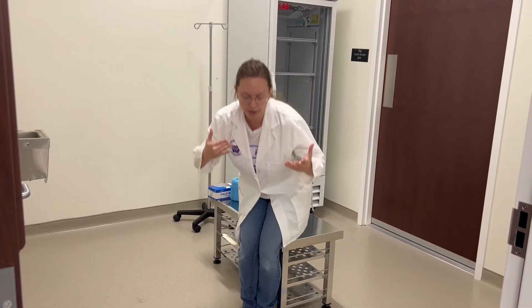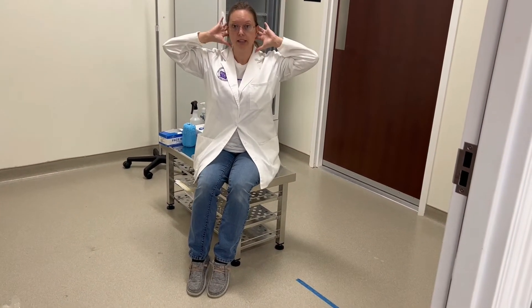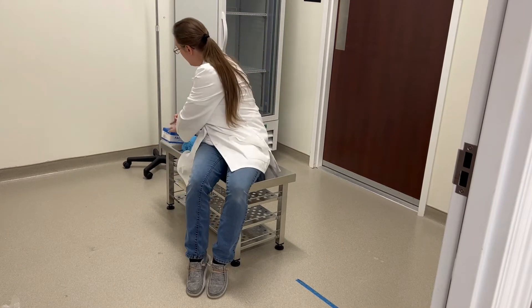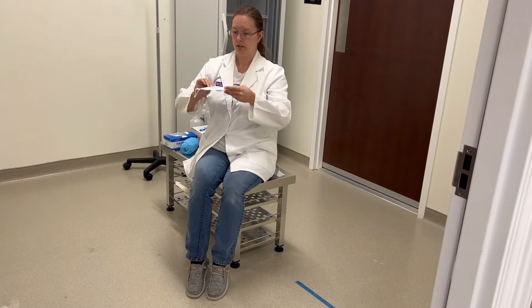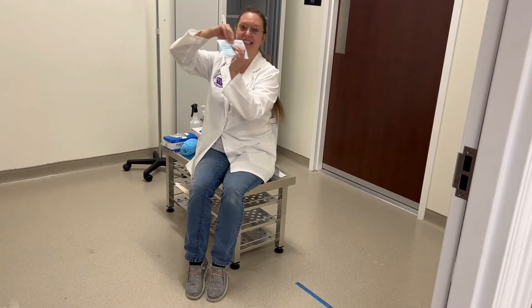What we're going to do in here first is put on our mask, our hair bonnet, and then our shoe covers. Mask first — you want the pleats on the outside facing downward.